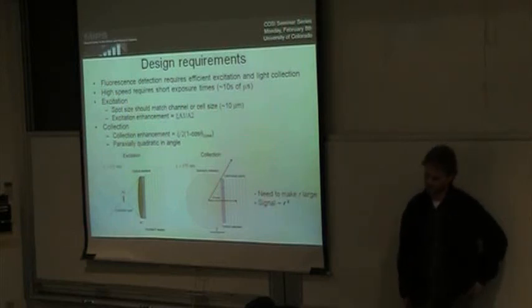Yeah, and a new microlens array will have to be designed around the fluidics. So if you want to change the geometry of the fluid channels, you're probably going to need a new one, not a one-size-fits-all. I guess it just seems like the alignment of your microlens array and your fluidic channels is something you're obviously sensitive to.